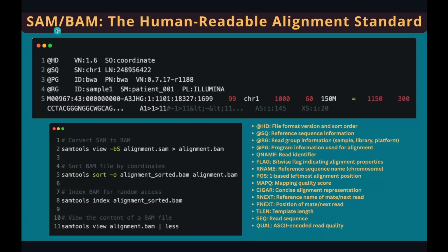We have SAM files and BAM files for alignment. SAM files are text files and are large, so we usually convert them into BAM files using samtools. The following sorting and indexing are required for subsequent analysis. SAM files can be directly peeked in with the less command, but you can't do it for BAM files because they are binary compressed files. So we have to view them using samtools view command. But this command shows you everything in the file, so we pipe it to less. Only show a small portion of the BAM file.